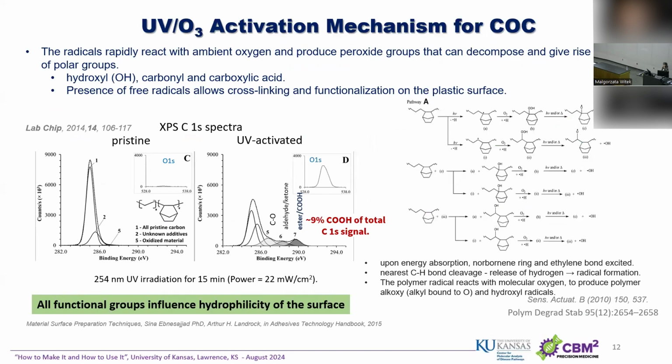So again, the same type of functionalities we see on polymethyl methacrylate, cyclic olefin copolymer, COP, PC. There's a slightly different mechanism, and you'll find this in the back section of my notes. For this conversation it's not relevant, but we always look at this, so you can see this is the XPS spectrum before photooxidation for COC.